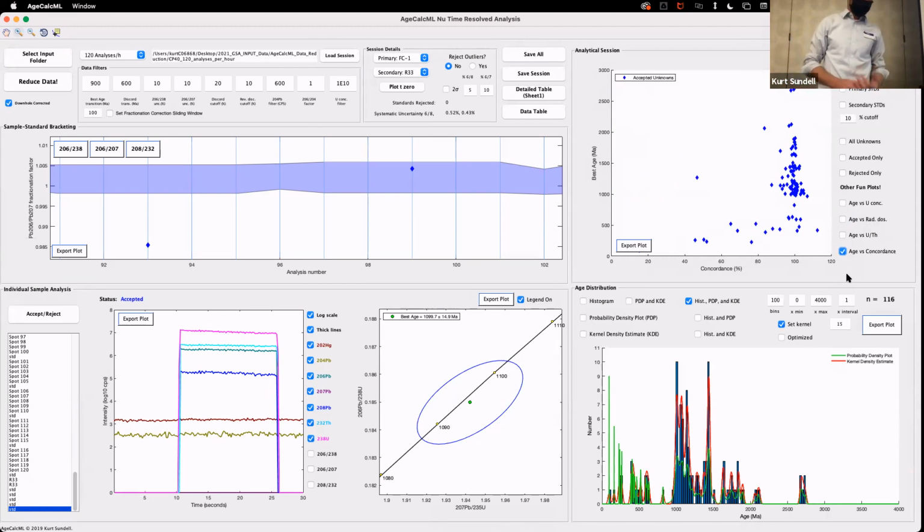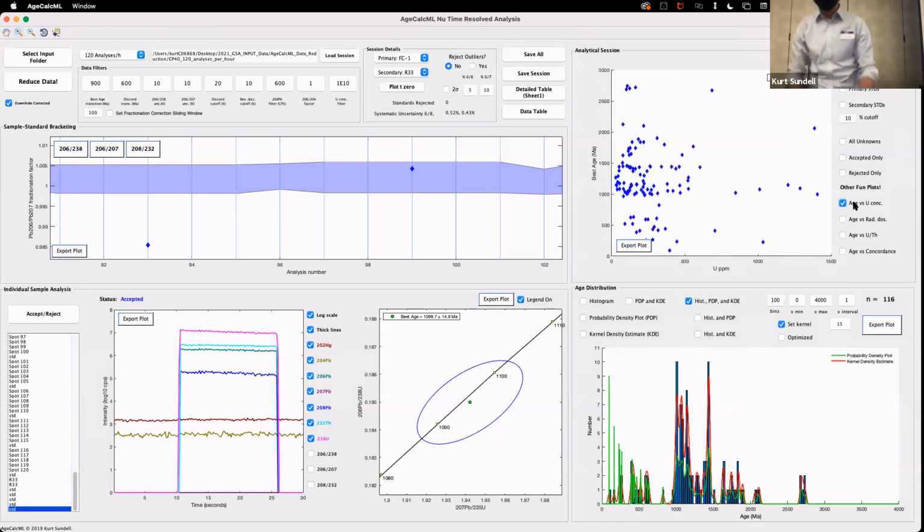Higher uranium concentration with younger ages, if you want to use that for maximum depositional age or single youngest range. So we should see a trend when you've got age versus uranium concentration. In this one, as you go to younger ages, you're getting higher uranium concentration. What might that mean, guys?